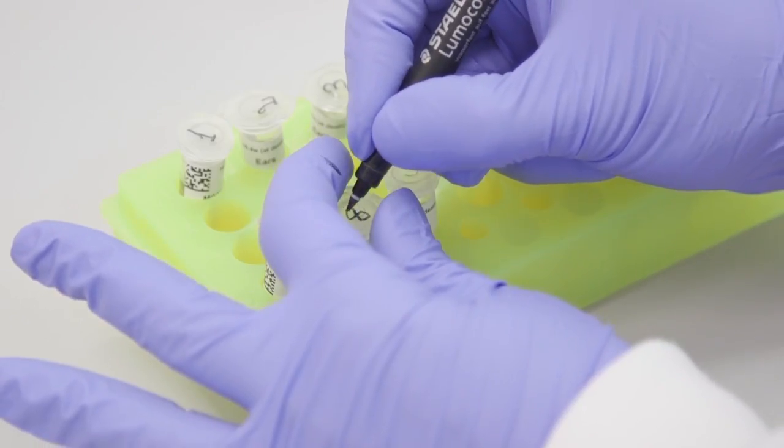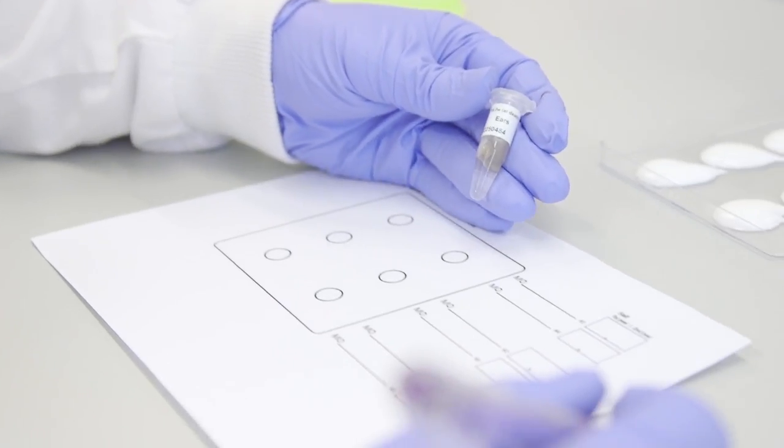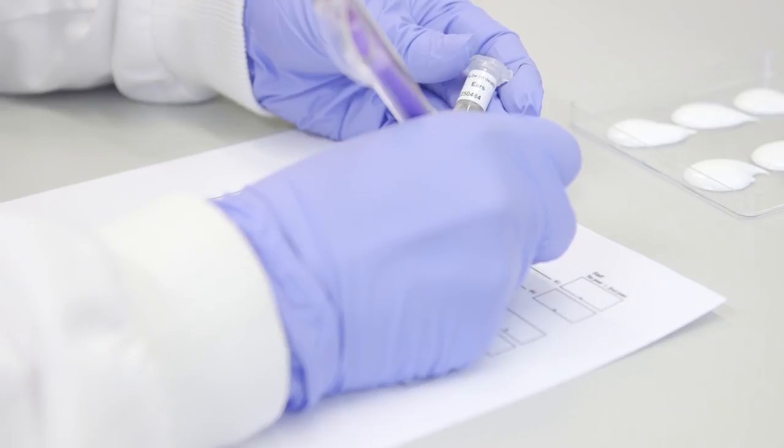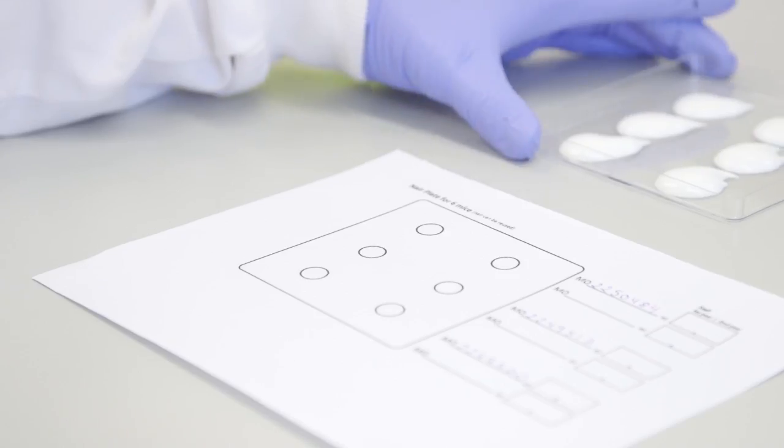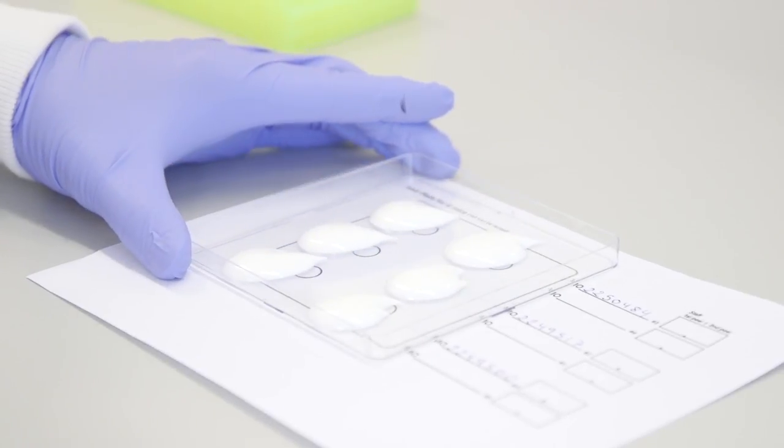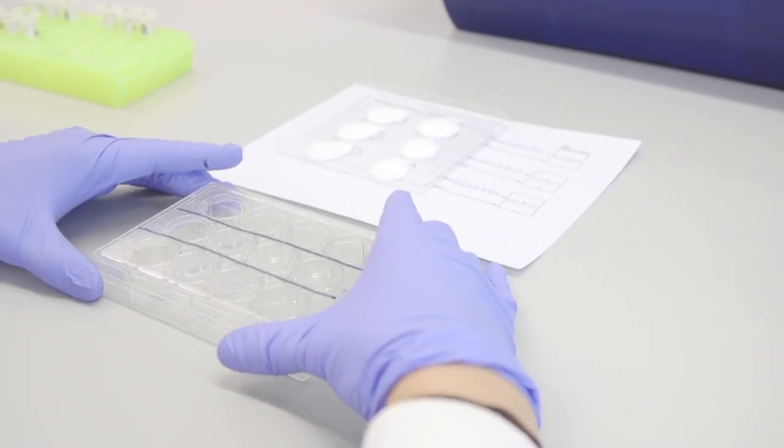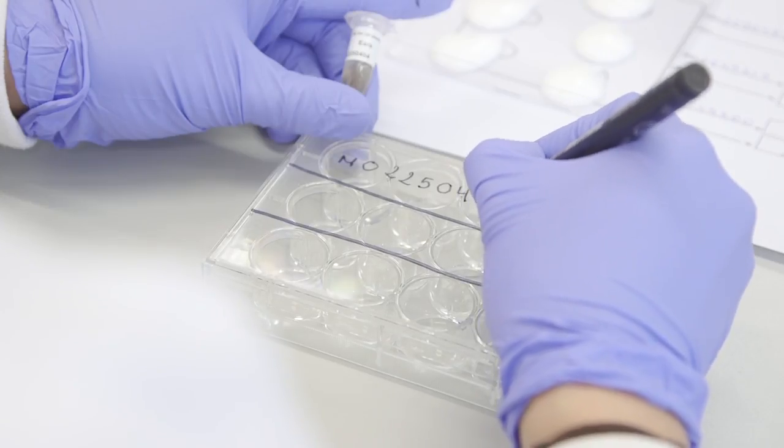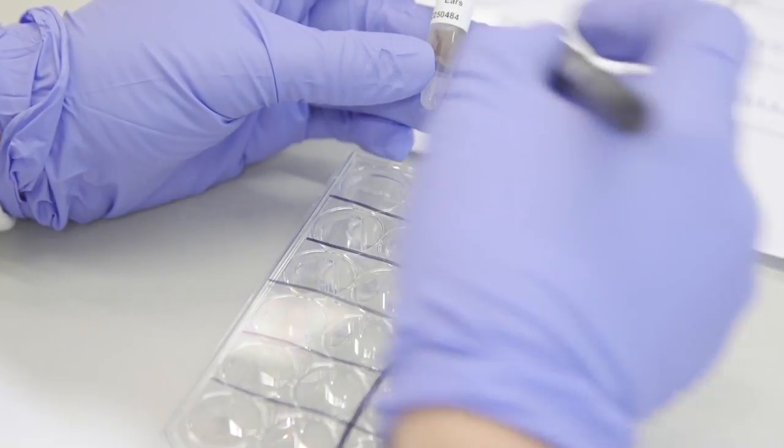Assign a tube to each row of hair removal cream and write down the ID number of the sample. Because the ears will be removed from the tube, accurate identification is essential. After doing this, write the ID numbers onto the rows of the 12-well plate. Also write the ID numbers onto the 24-well plate.